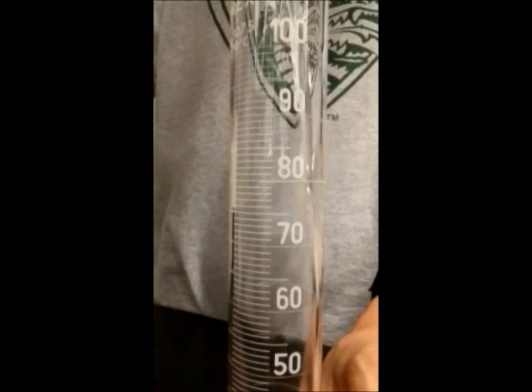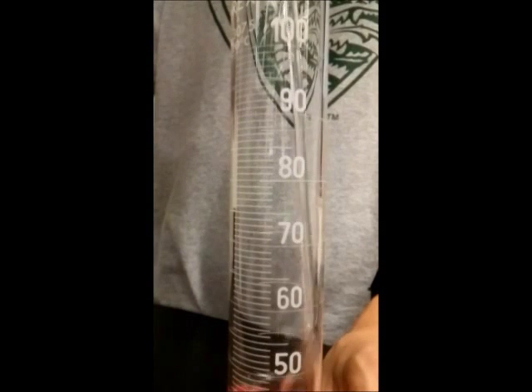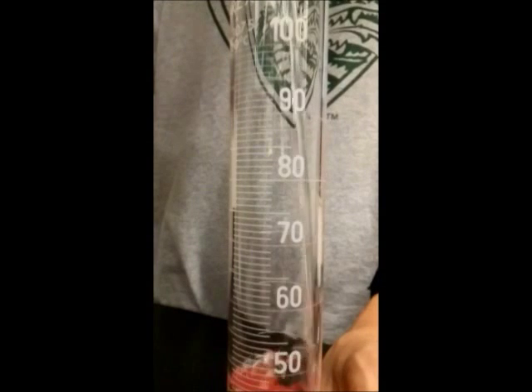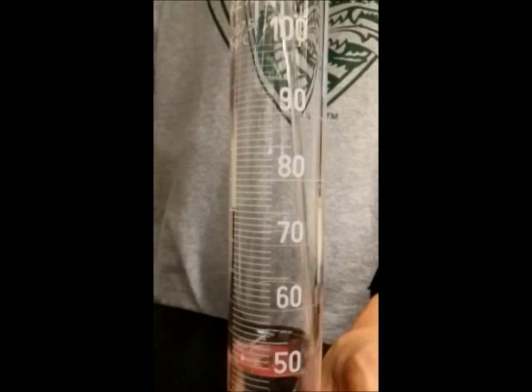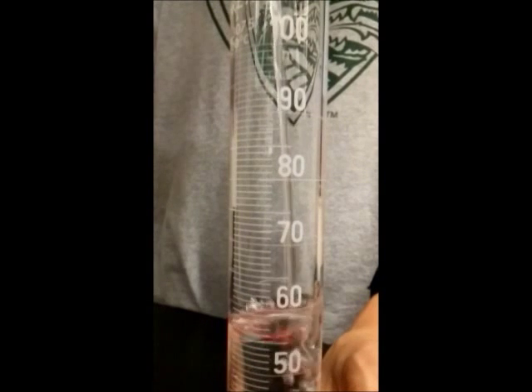In order to accurately measure volumes, we must use the meniscus. The meniscus is the bowl-shaped top of liquid volume. Since the liquid has an attraction with the glass, the edges around the glass curl upward, making a bowl shape.